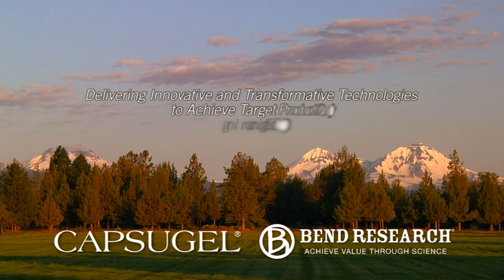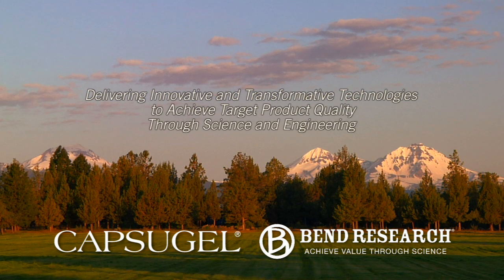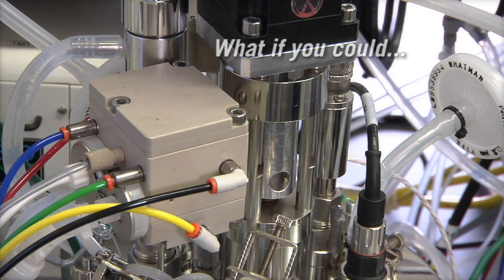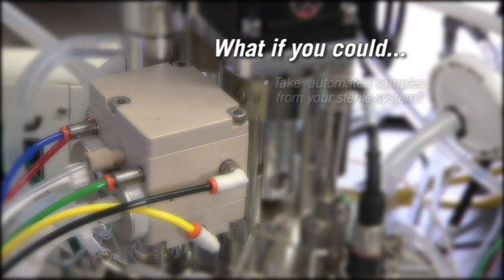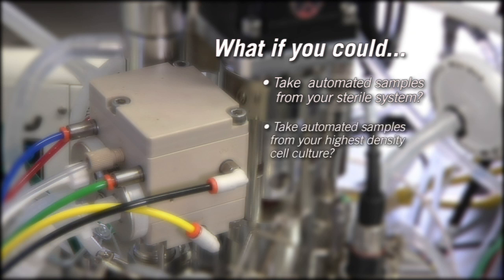Bend Research, achieving value through science. We know you want to understand what's really going on inside your bioreactor.